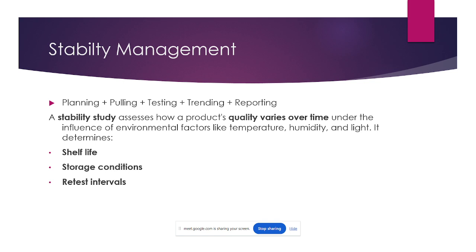Once stability management is integrated with Tableau or Power BI, every month's tests and results will be shown in a single dashboard. Otherwise, in the LIMS application itself we can generate a report, like a stability compilation report, and compile the data. Each month's result, whether anywhere failed or not, we can check in the trend data, or in the single dashboard if integrated with Tableau or Power BI.